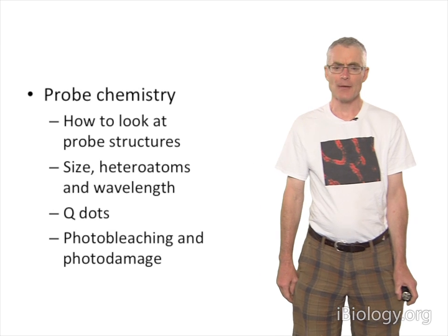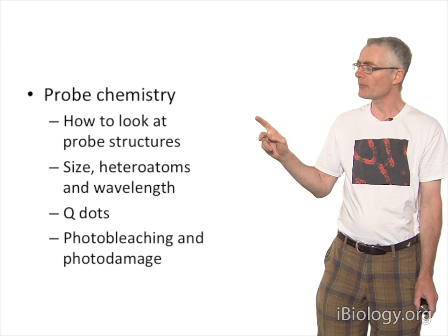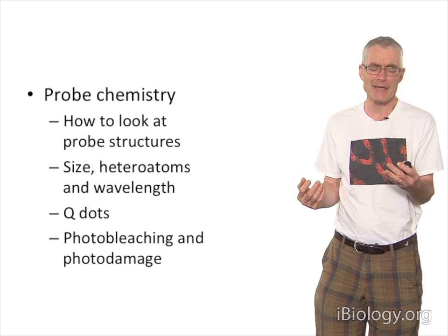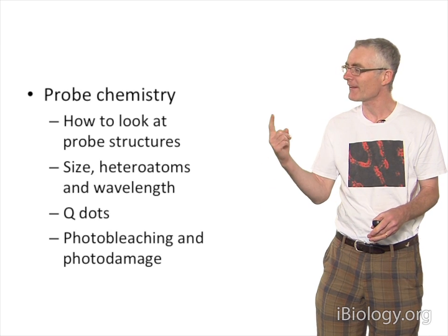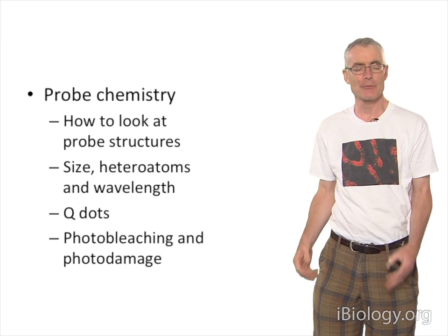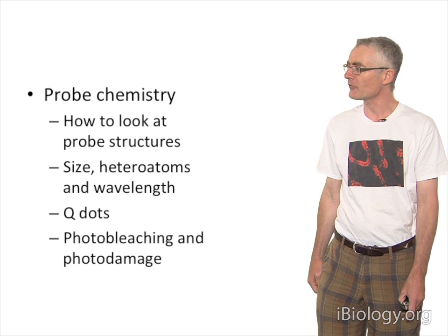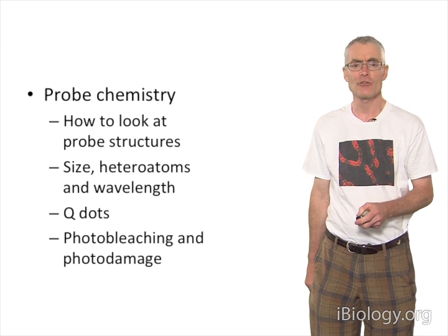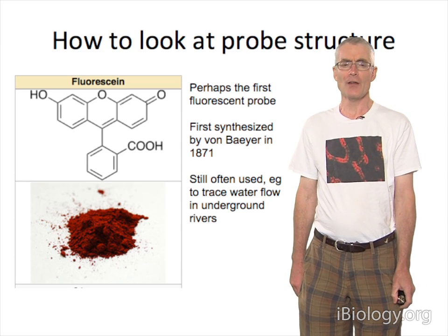Okay, and in the chemistry section here, I want to talk about the structure of probes. I want to spend quite a bit of time on that. People buy a probe from a catalog and they attach it to a protein, they never really think about what that molecule is. I'd like to encourage you and give you some tips for really looking at and appreciating these molecules. Talk about how the wavelength is determined, just briefly mention quantum dots, and then issues like photobleaching and photodamage. Okay, so we'll start here.